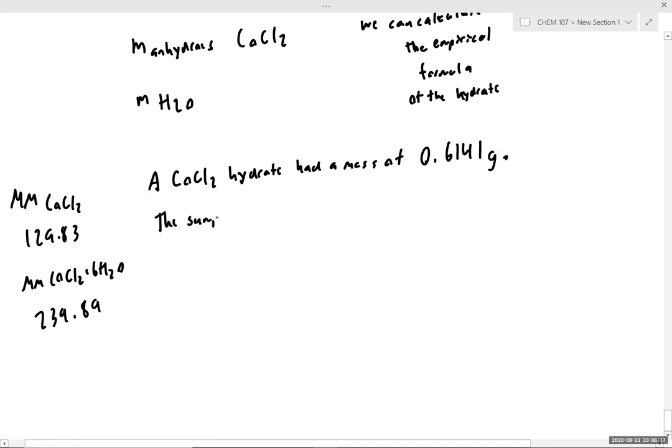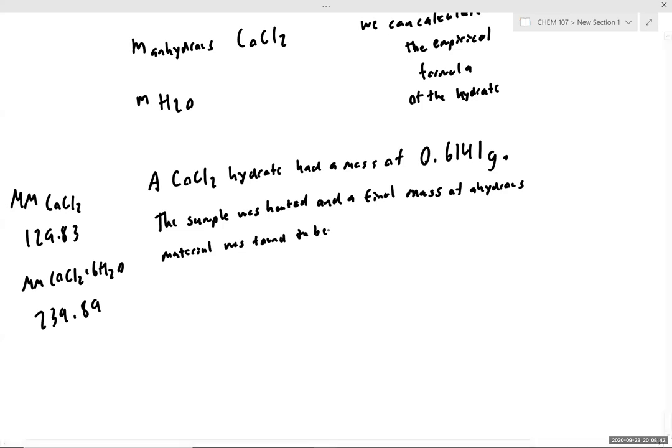The sample was heated and a final mass of anhydrous material was found to be 0.3324 grams.